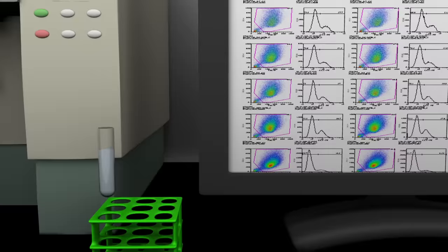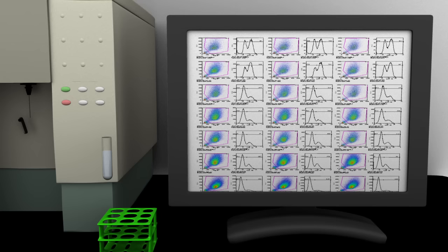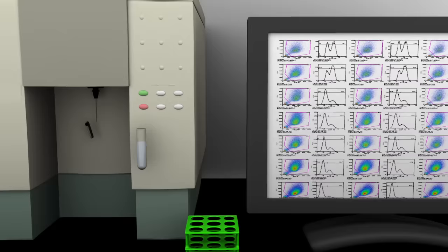Once a suspension of individual cells has been prepared for flow cytometry analysis from cells, tissues, or organisms, the prepared sample is placed on the flow cytometer.